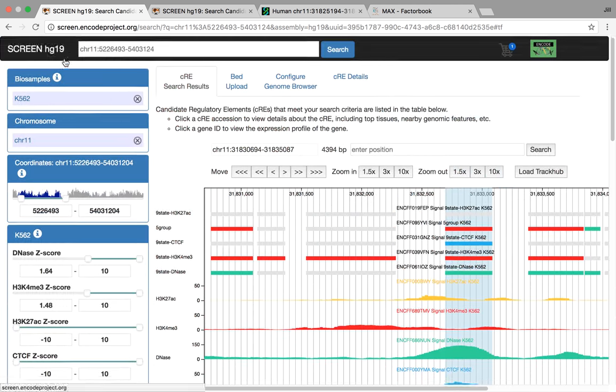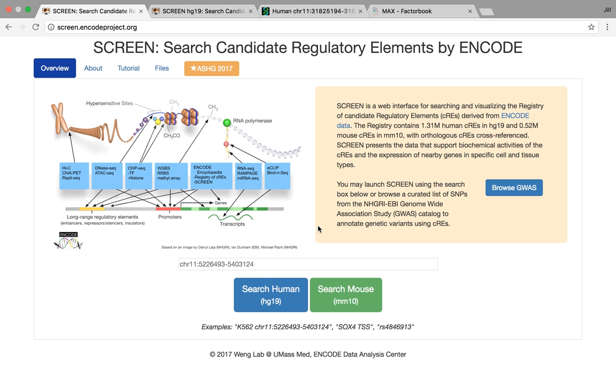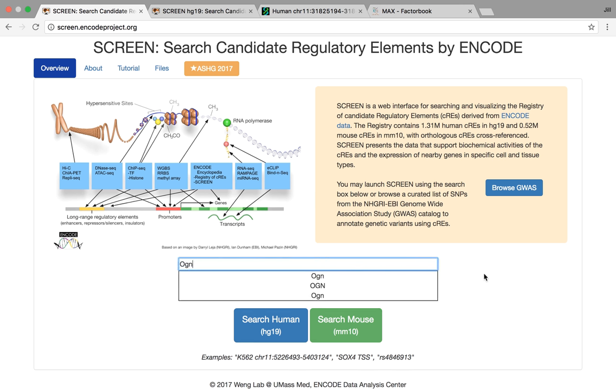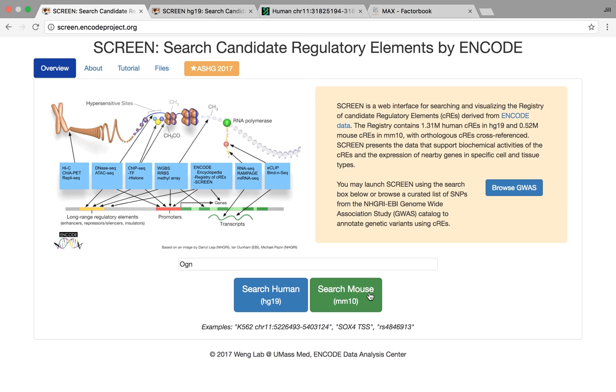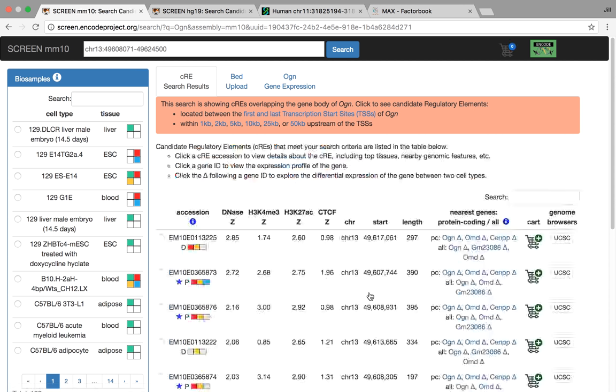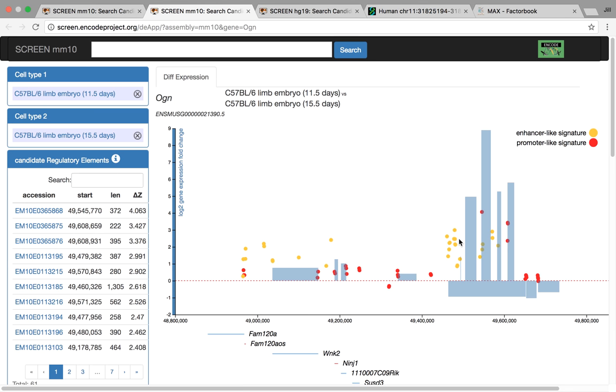Alright, halfway done. A few things left. There's another app. Let's say we go over to the mouse world. We have an app that shows you differential gene expression for mice. As you saw, we have some very nice mouse datasets. So we developed this tool. Basically this is taking the mouse RNA-seq data and running DESeq2 and outputting the results.